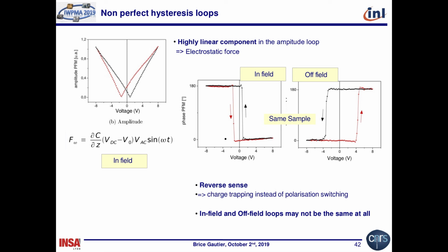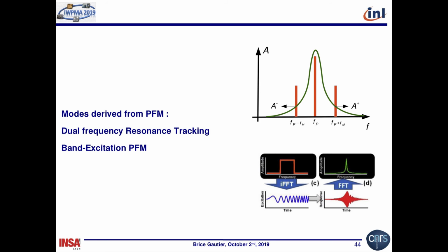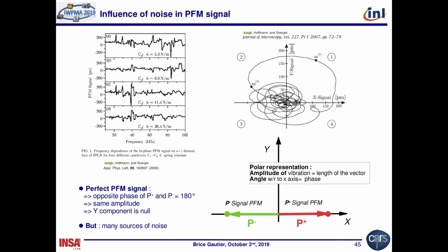Okay, now I will switch to the enhanced mode of the PFM, which I'll call the dual frequency resonance tracking, and I will say a few words about band excitation PFM. Dual frequency resonance tracking is used by everyone now, because this is a matter of noise.